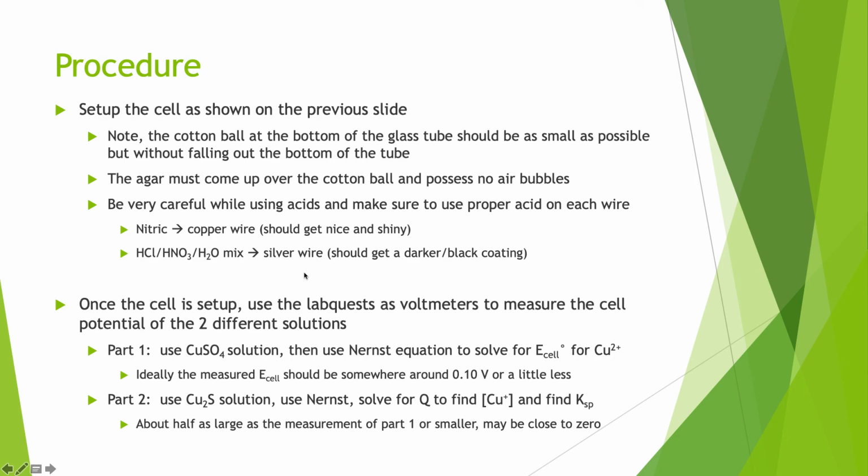It's a pretty short experiment. Usually it doesn't take much more than an hour to an hour and a half. It's really just dependent on how quickly you get your cell set up, because getting the agar portion of that cell setup is the part that takes a while. And once you have that done, then the rest goes pretty quickly usually.